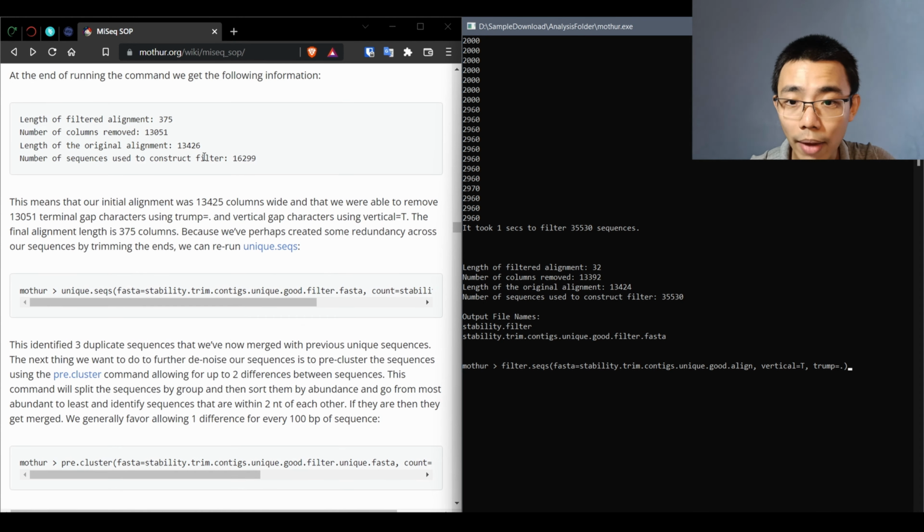Tax summary here. So these are the taxonomical summary for all the individual taxon levels, rank ID, taxon, and all the individual samples. You should be able to open this in your Excel file or some other R tool so that it's easier to visualize them, but we're not going to go deep into that. We're going to go into that in our second video.